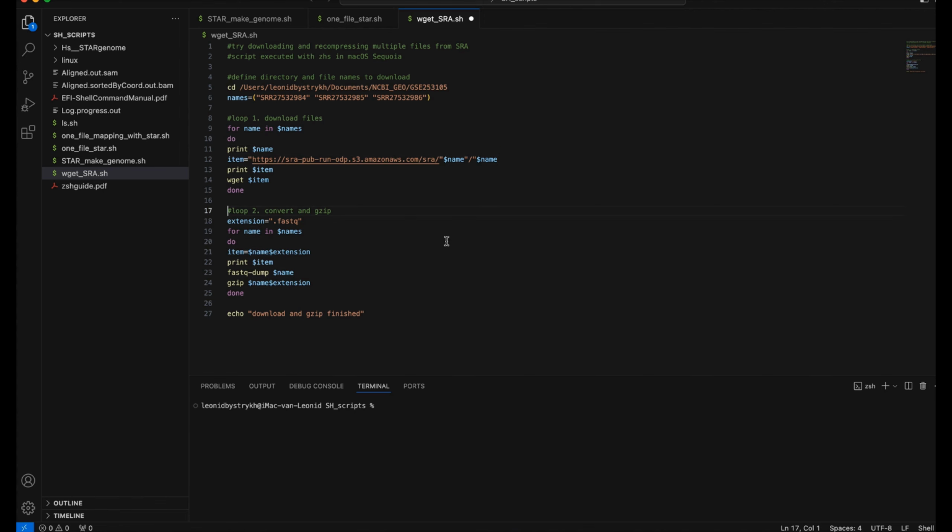And the rest, if you are not sure yet, you can hashtag it and then observe how it will be downloaded to the directory you define. Pay attention that there is no real help for troubleshooting your problems. Shell scripting is a rather cruel sport. If you make a mistake, it will never tell you what kind of mistake it was, or it only will indicate the line where it happened. So, the rest is yours.